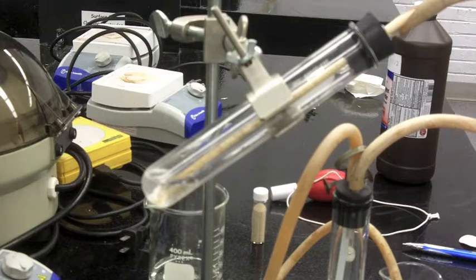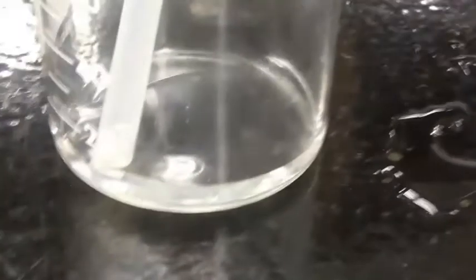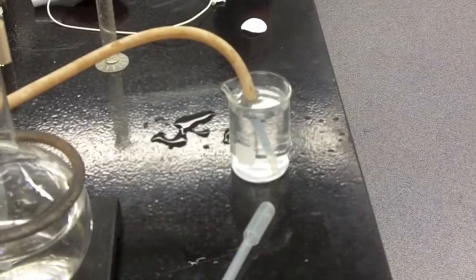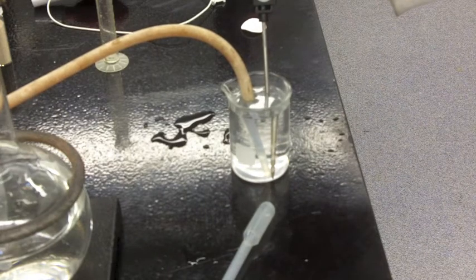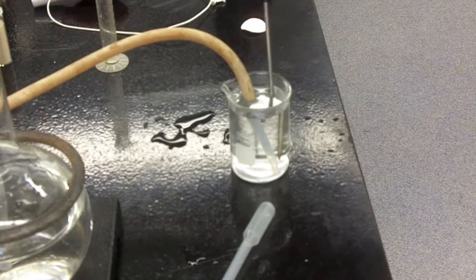You should be able to see some vigorous bubbling from the yeast. It will take about 10 or 15 minutes. You can see it's pretty foamy, so you're going to need to beat on it to get the foam out of there. At the same time, it's going to start displacing water, so you will see the water being displaced into the flask. When it's done, you'll want to measure the temperature of the water. That will be important. We're also going to measure the barometric pressure eventually.